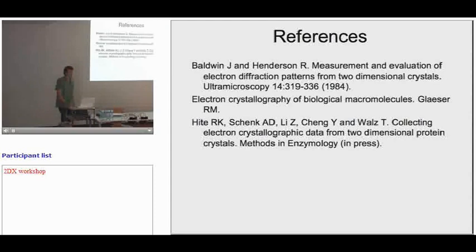You always need a known structure of your protein in order to do molecular replacement? Or something closely homologous. It needs to be about 30%. And if you think that you have a complex of proteins, with one known protein structure and the other one is not known, is it possible to determine the other one? It depends on how close they are and also how much of the total mass of the asymmetric unit cell it is. Usually the rule is about 30% identity and about 20 to 30% of the mass is made up by that component.